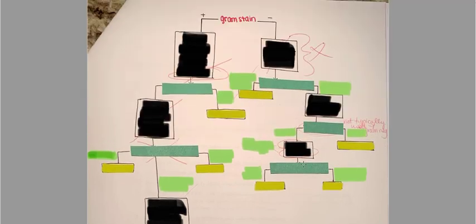All the way until there's this final test here, and that's splitting up the last two organisms, which means if it ends up this way, I have this one. If it ends up this way, I have this one. And so you can see that on both the gram-positive and the gram-negative.